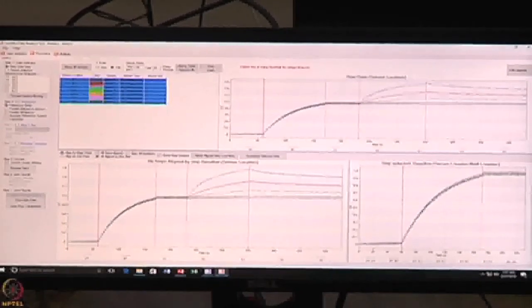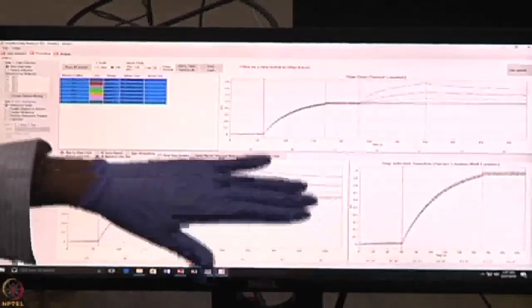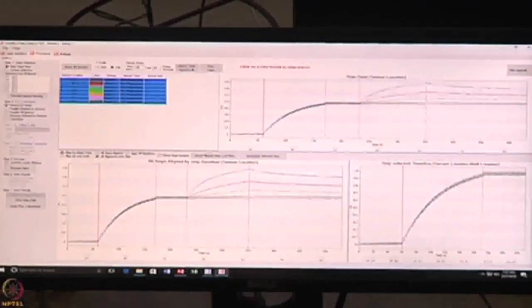What happens is generally these proteins are charged species. The fiber optic is silanol, SiO minus. Then if your protein is positively charged, there is a possibility of a tendency to attack this glass, and then maybe you can see binding. That's why we add surfactants. But if you are still getting non-specific binding, you have to address that first, and then go for the experiment. In this case, it is a very well-tested molecule, and IgGs in the presence of Tween as well as BSA will not show any non-specific binding. So that's why I went directly with the experiment.